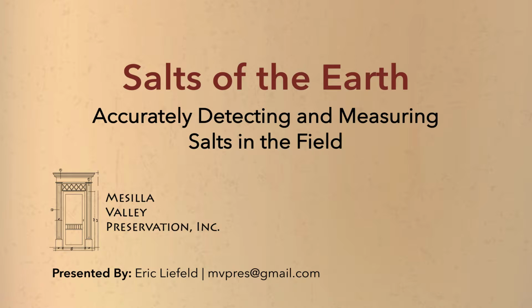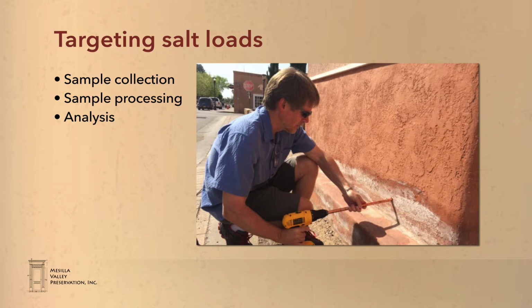Previous videos in our series have covered salt attack, so hopefully you have a good understanding of what causes salt attack and how to recognize it. In this video, we'll look at MVP's tools and process for accurately detecting and measuring salts in the field. This video will focus on sample collection, sample processing, and analysis. There are other live-action videos in this series that document both sample collection and processing for those who want a more in-depth description.